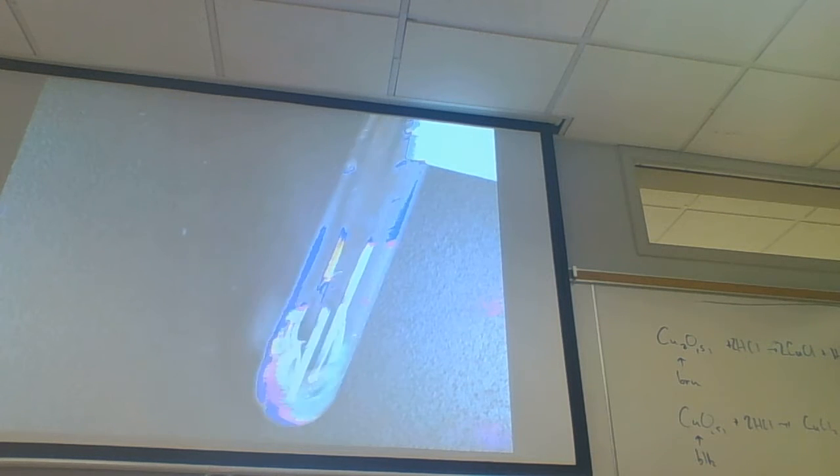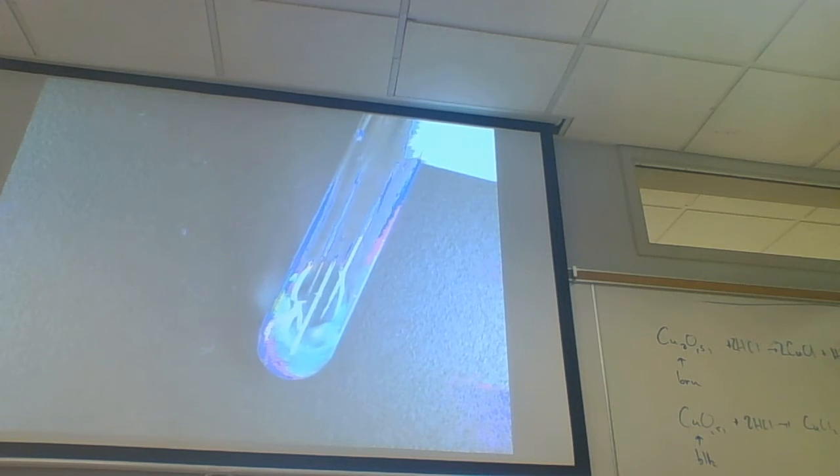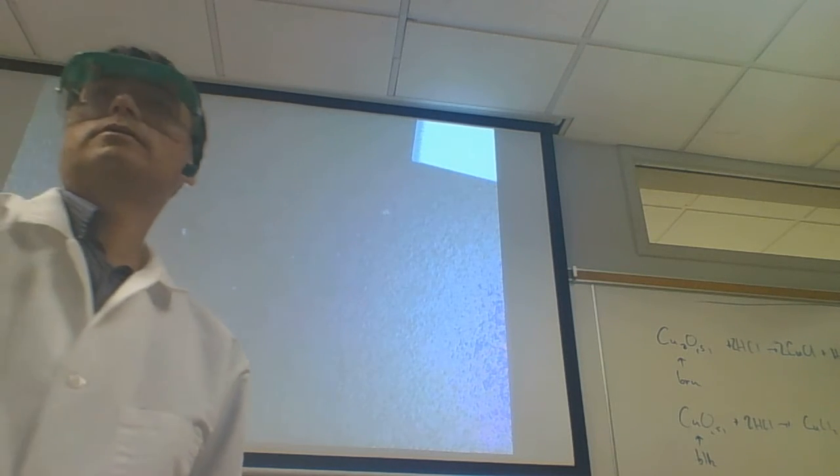Do you see the blue color? Yeah. Do you see the bubbles? Oh yeah, I do. Now you can see it's turning pretty blue, right? Here, I'm going to just plug it with my fingers. We'll sacrifice them.